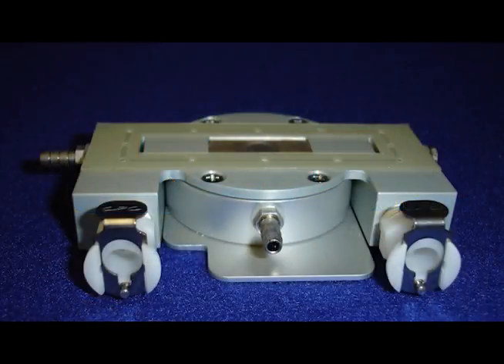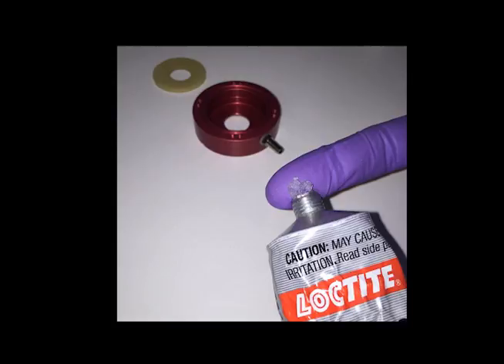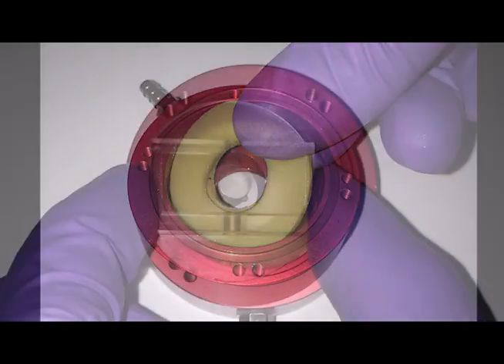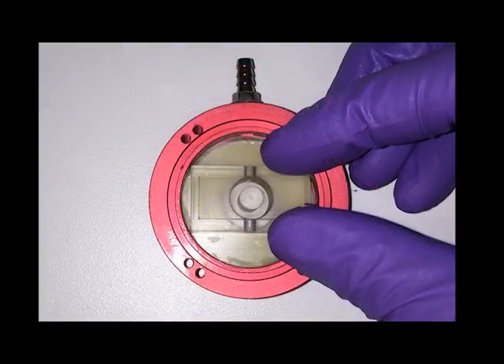Next, we'll assemble the FlexFlow device. First, apply to the bottom and inside surfaces of the stage flexor body a thin layer of silicone lubricant. Place the yellow gasket ring into the stage flexor body and apply a thin layer of grease to its top surface. For strain application, place the stretch and flow post, which has a circular ring in its center, on top of the gasket and rotate it so that the long side of the post is perpendicular to the fittings on the front of the stage flexor body.